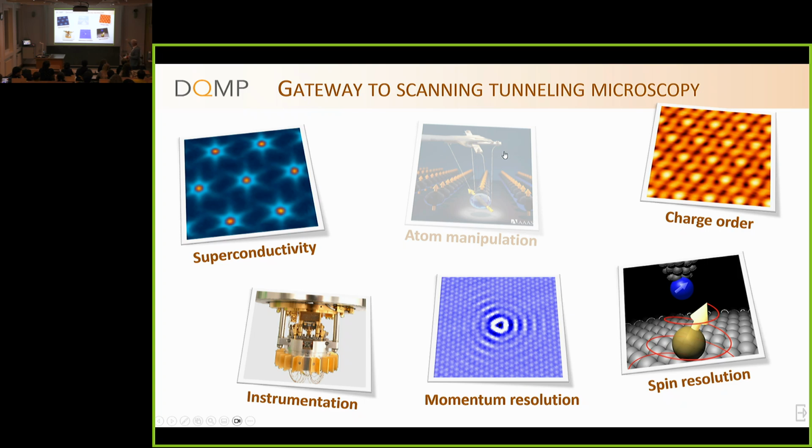No. So these single atom chains, once you master it, you can make a 10 atom long chain, I would guess, in less than an hour once the system is set up. But you first need to set it up, which can be quite longer. We don't have personal experience moving atoms around, but looking at the time it takes to scan, this is probably what it would take.